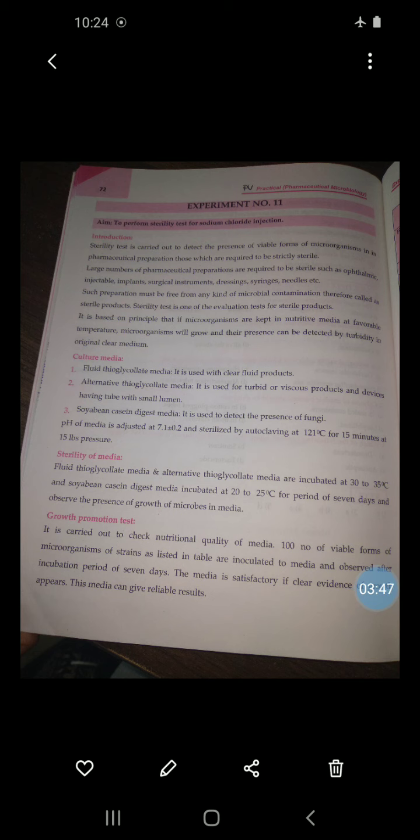Then the growth promotion test is carried out to check the nutritional quality of the media. 100 viable microorganisms of the strains listed in the table are inoculated into the media and observed after an incubation period of 7 days. If clear evidence of growth appears, the media is satisfactory and can give a reliable result.